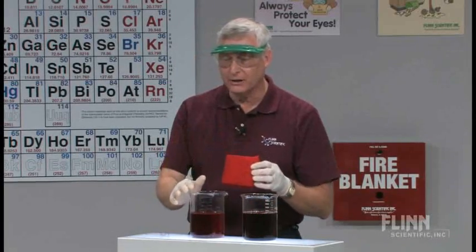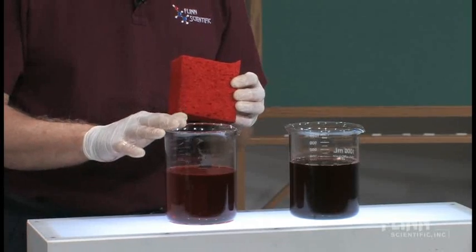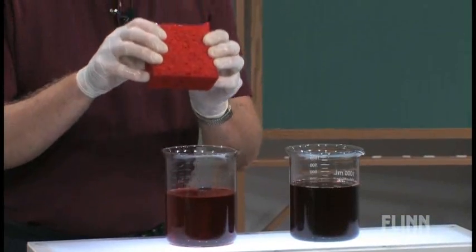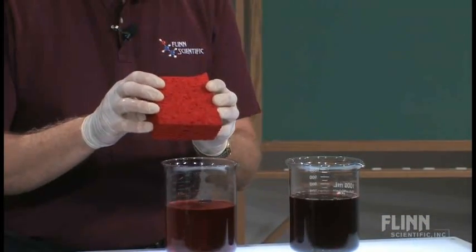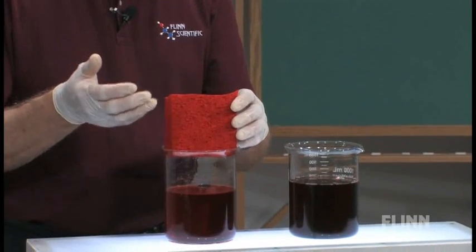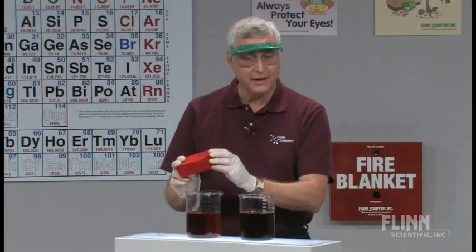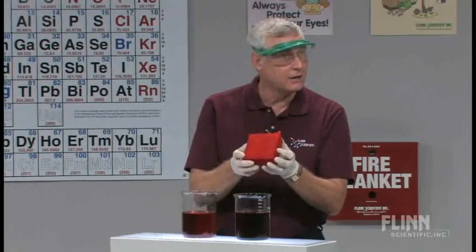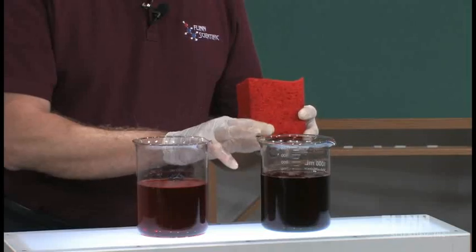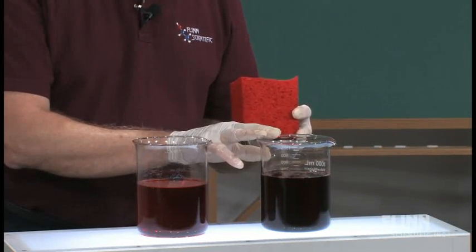So what I have here is a dilute solution of hydrochloric acid, which has red food coloring added to it so that it looks red. But when I dip the basic color, the red, which is the base color of the Congo red, into the red solution, it picks up the acid and it turns that red color to the acid form, which is blue. Then taking that now acidified Congo red sponge and putting it into the blue solution, which, as you can imagine, is a very dilute base solution of sodium hydroxide with blue food coloring added into it.